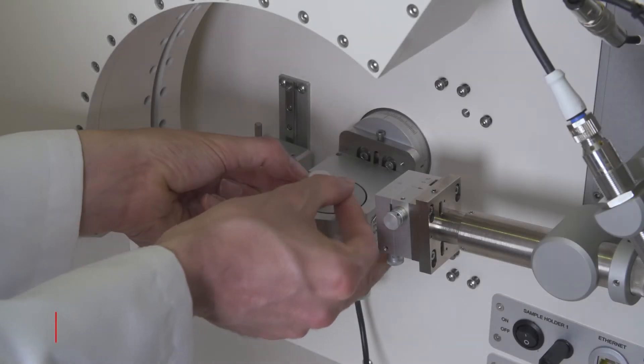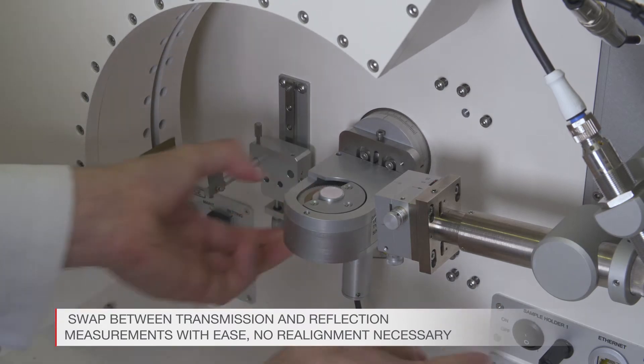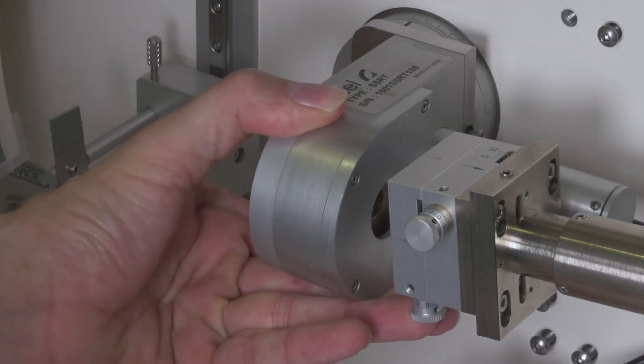You can easily swap between transmission and reflection measurements. No realignment necessary. One sample holder to do it all, including spinning.